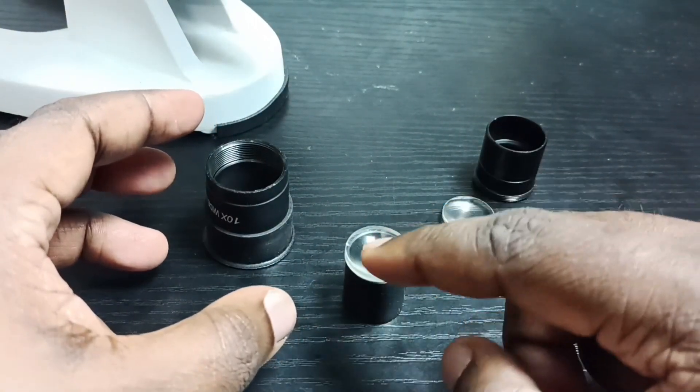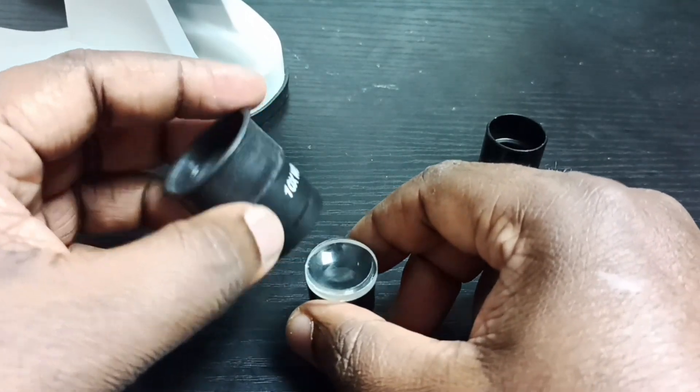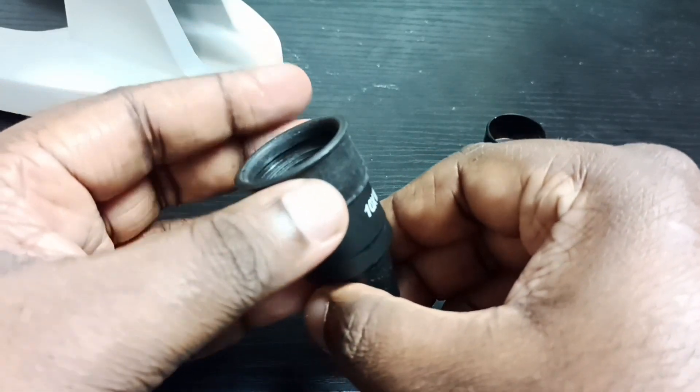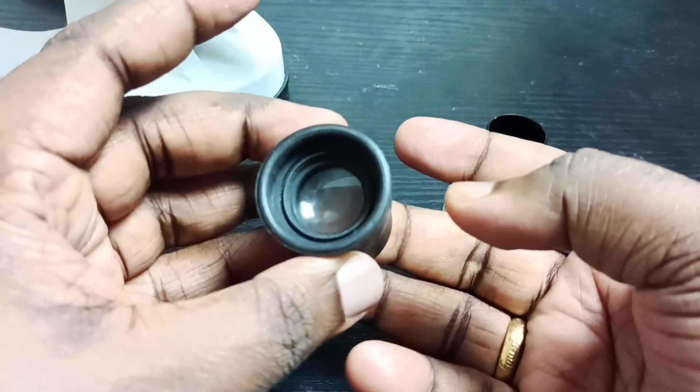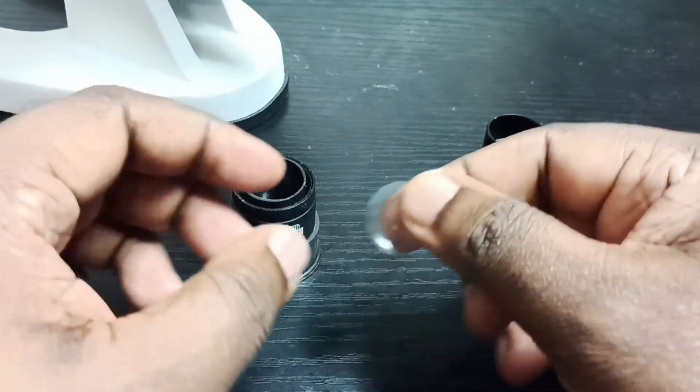Then you can see this side is straight — that side goes inside. Put it inside; the straight side has to go inside. This is the second side. Keep it like this, then take the second lens.